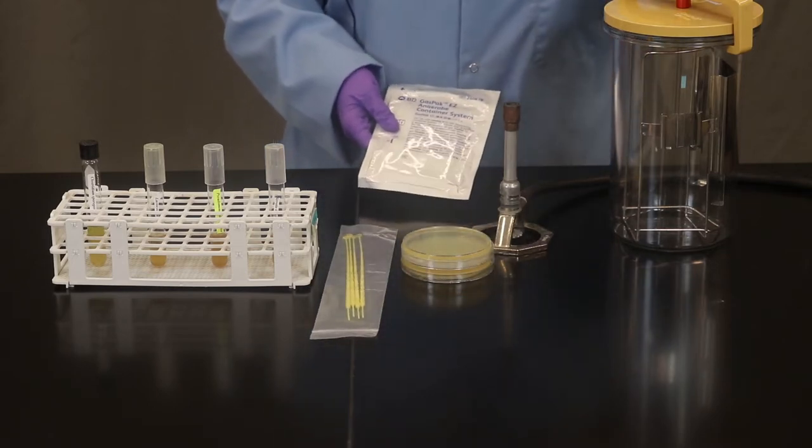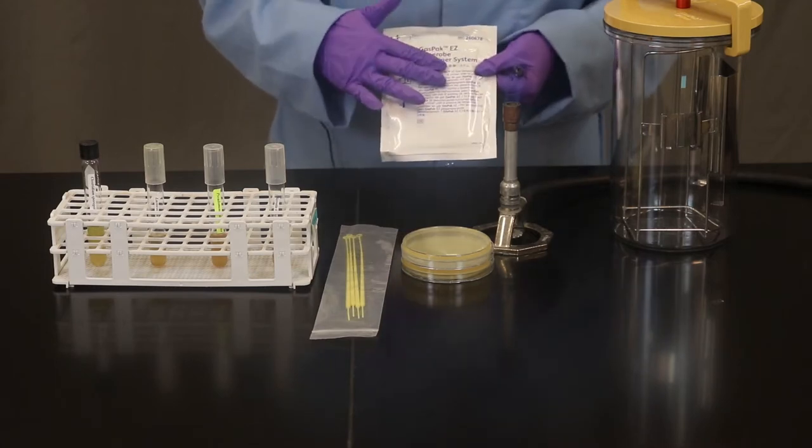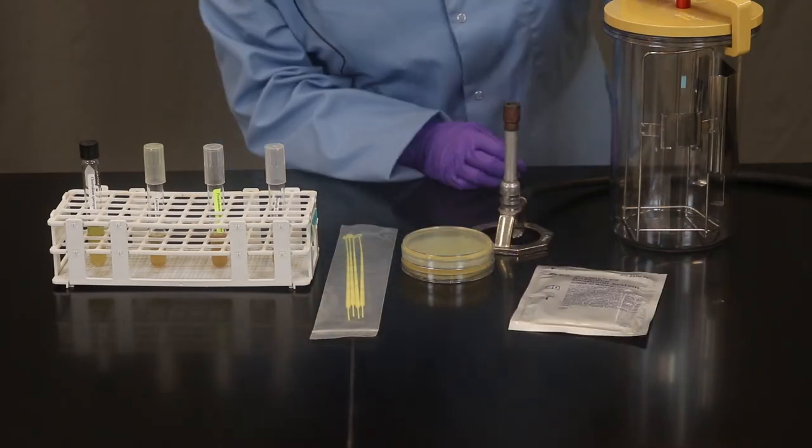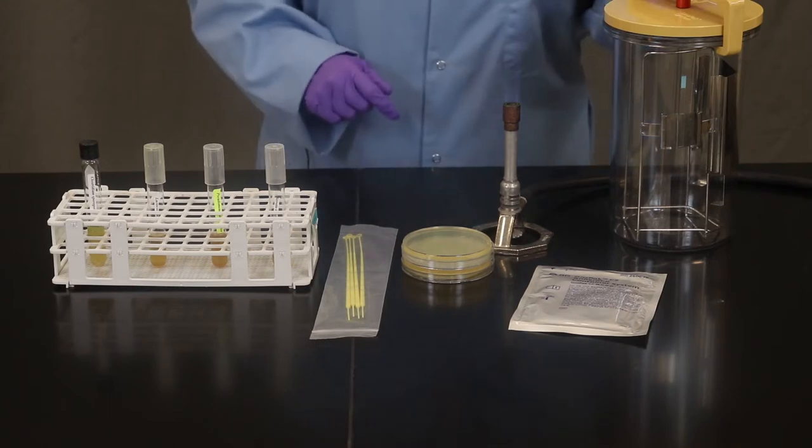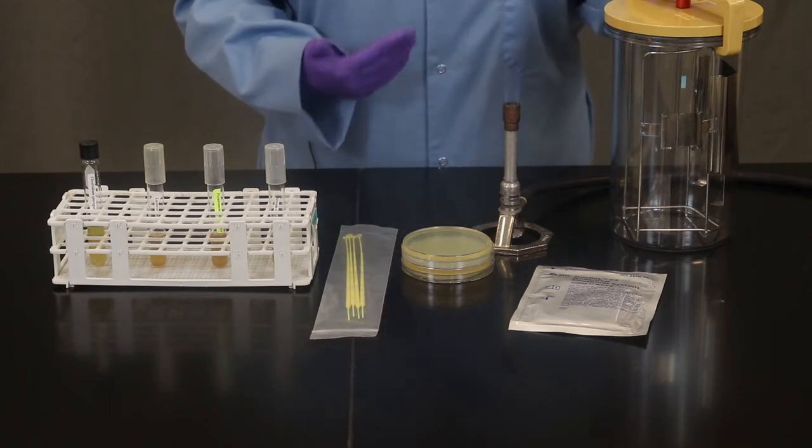So in order to do that we're going to have an anaerobic jar, a gas pack to help us remove the oxygen, and an indicator strip which tells us whether or not oxygen has been depleted in our jar.